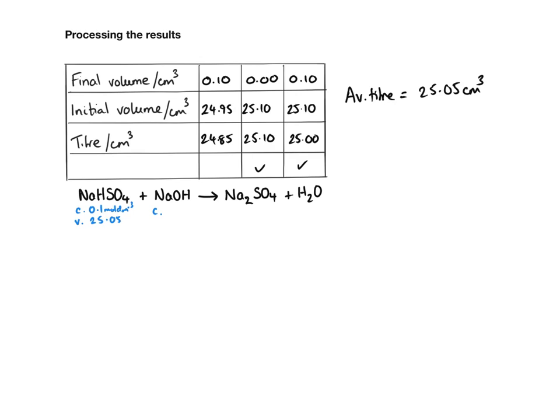The concentration of the sodium hydroxide is unknown. That is what we're trying to work out. But the volume was the volume we used in the pipette, which was 25 centimetres cubed.